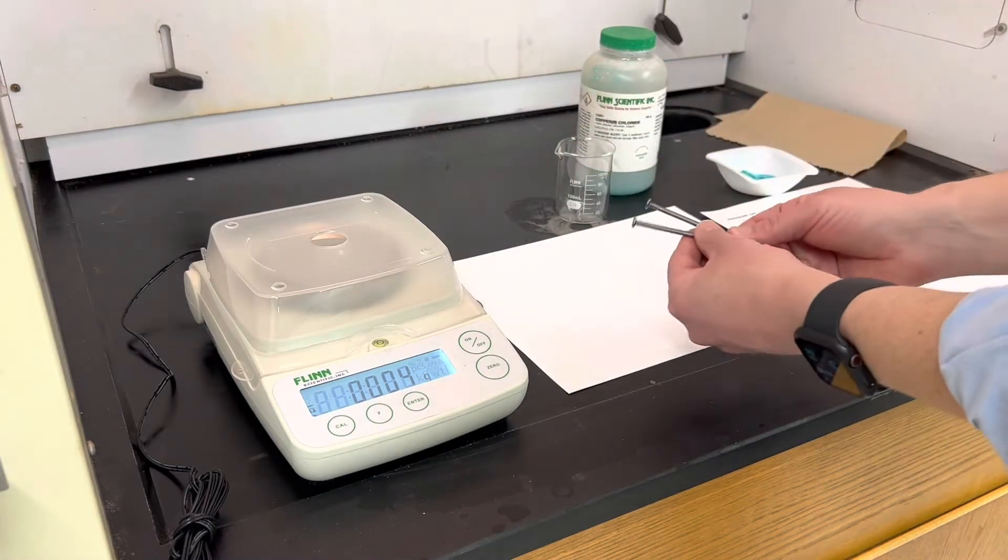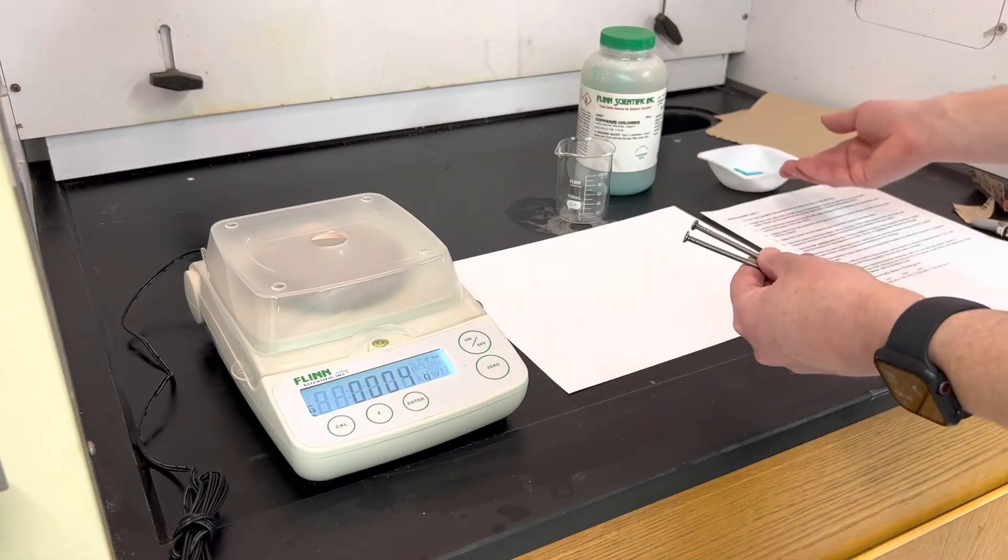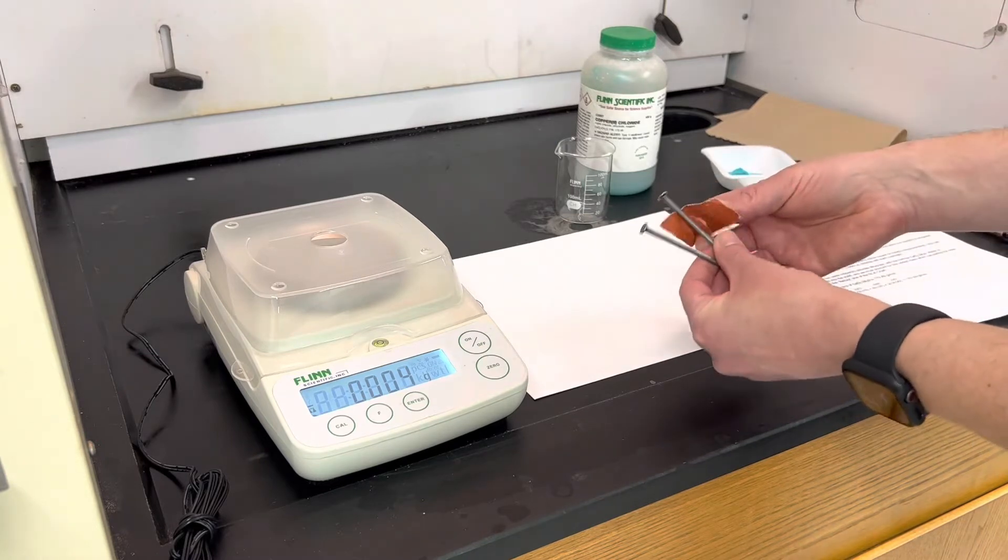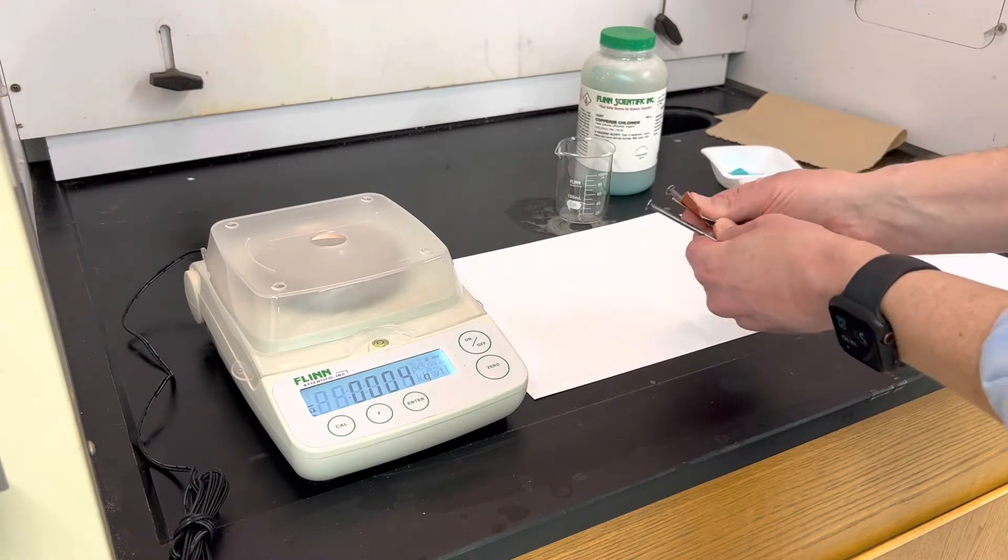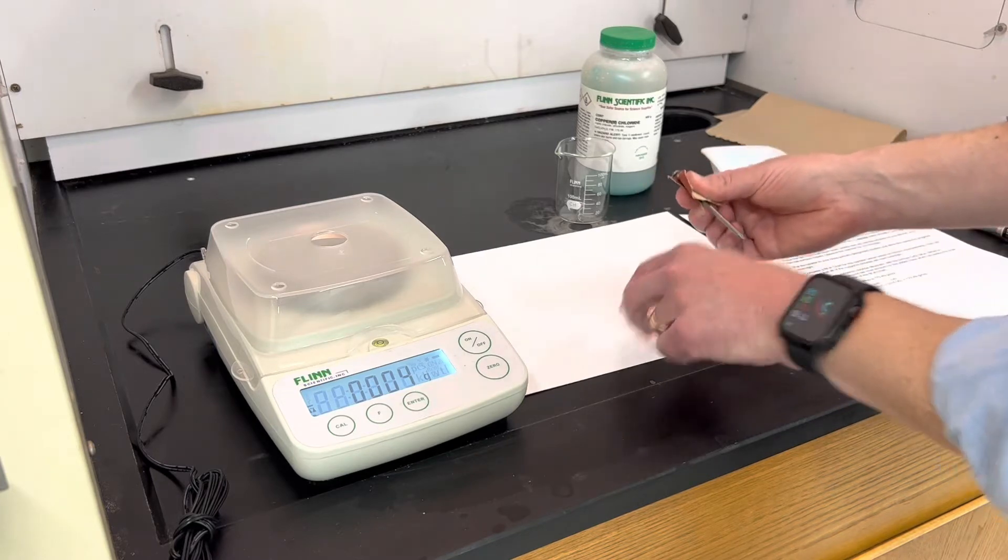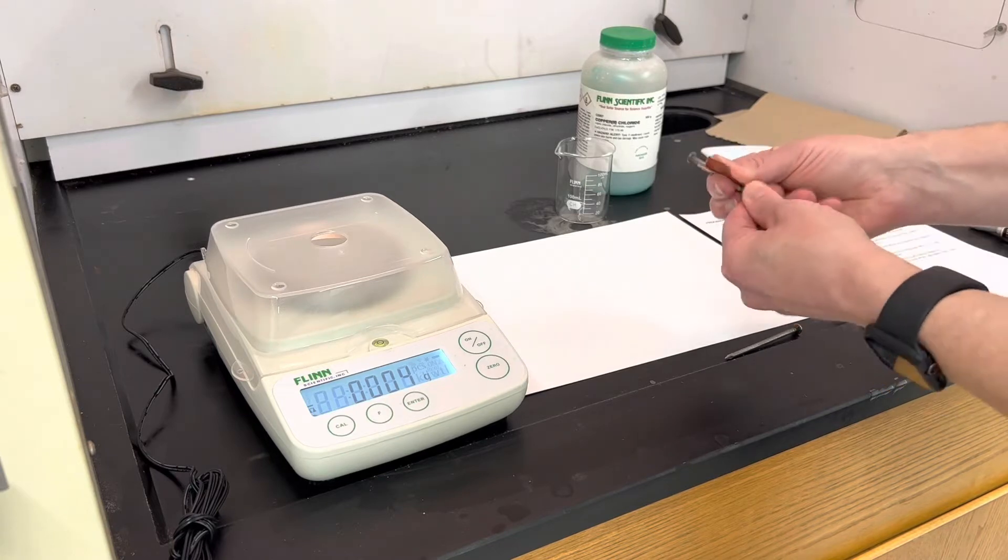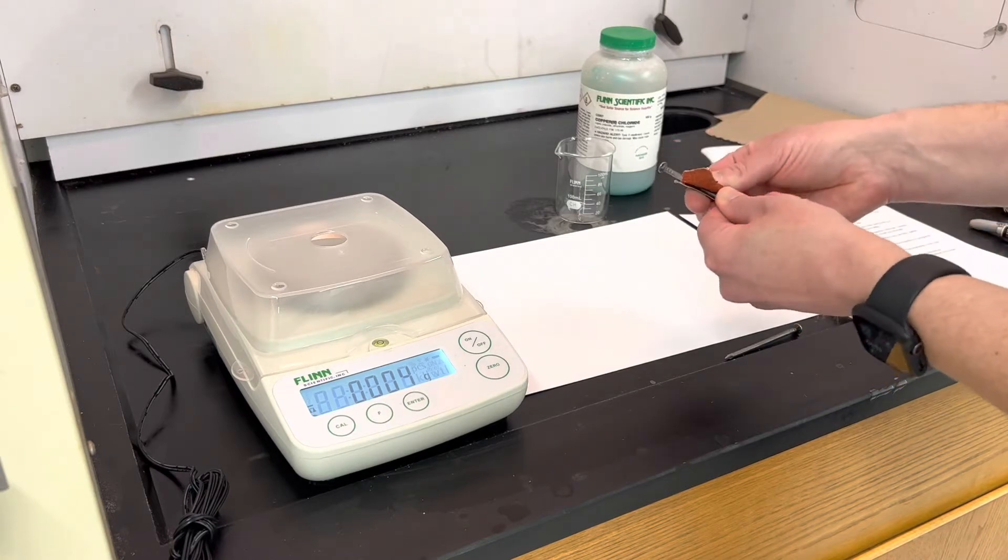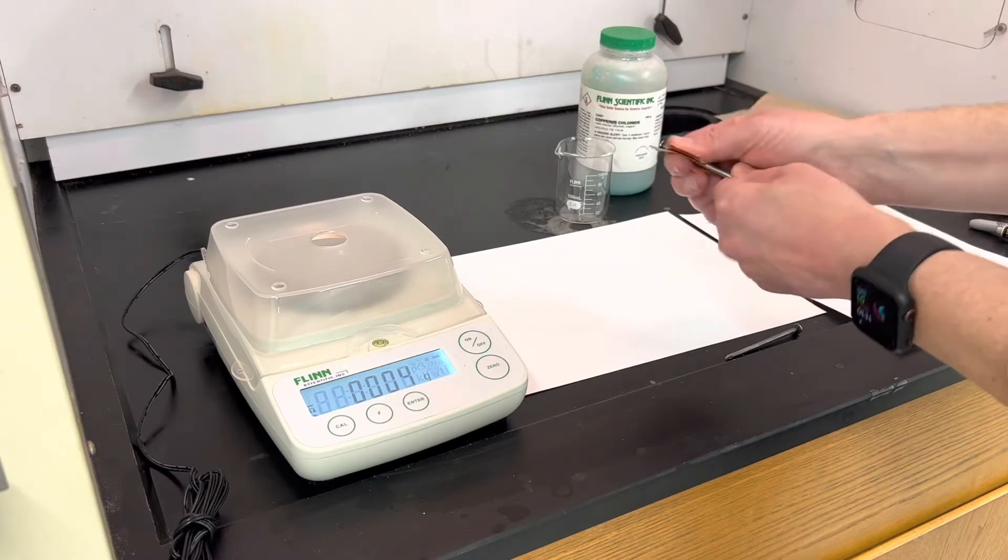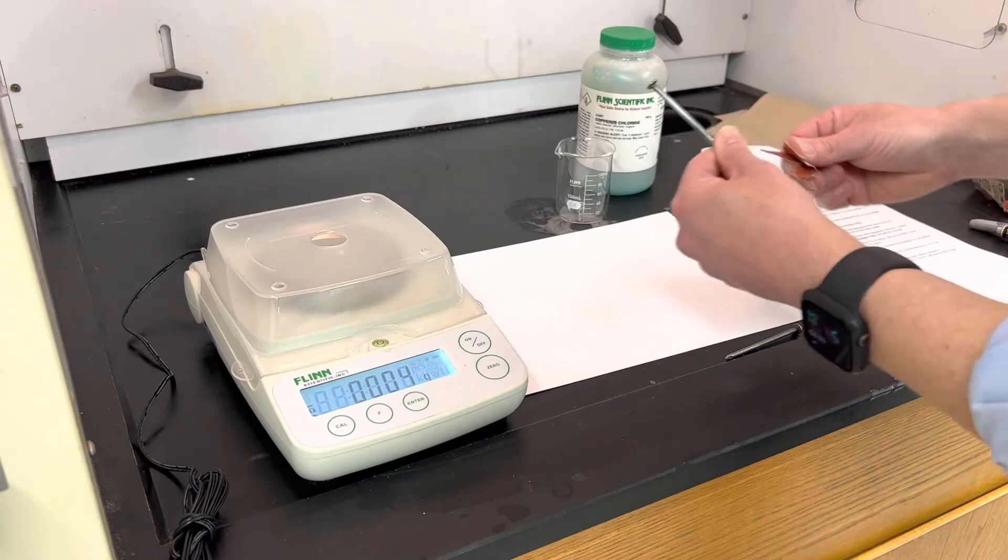The next thing you want to do is prepare two nails. They're the source of the iron for the reaction. The procedure will tell you to sand these, and all that does is scrape off any iron oxide that is on the surfaces. You want to make them a bit shiny. The reaction is going to take place on the end of the nail, the not pointy side. So you just want to rough those up a little bit until you see more of a shiny surface coming through on your nails.